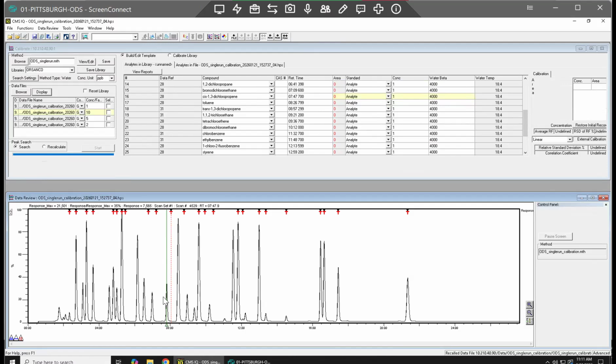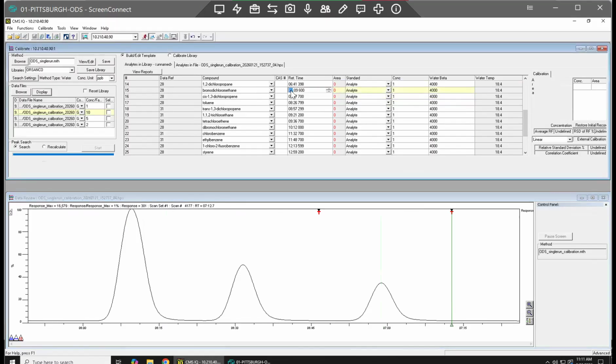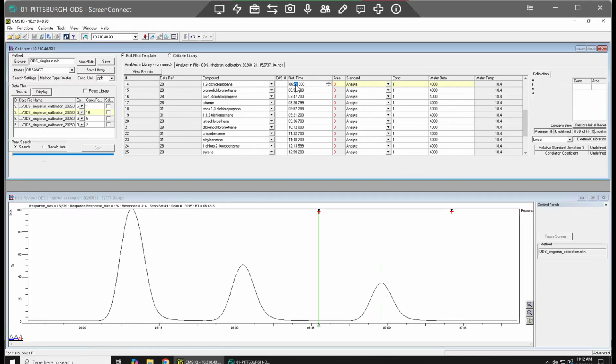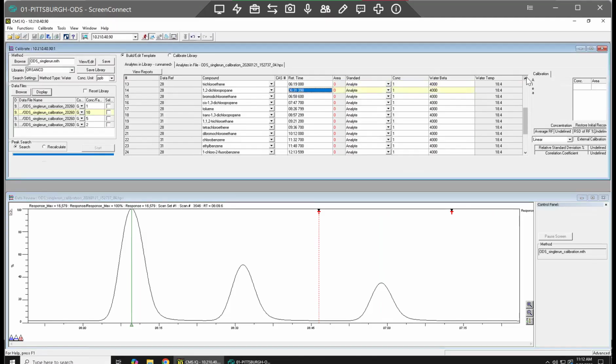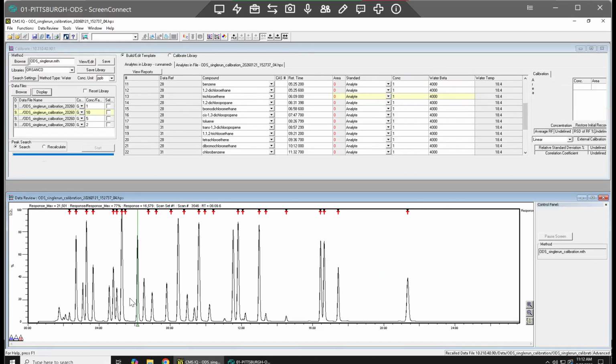And then we've got these three: 658, 631, and 609. Okay. These four.